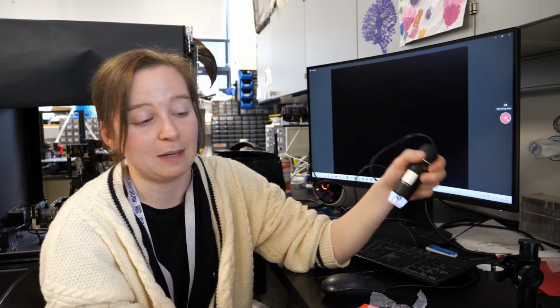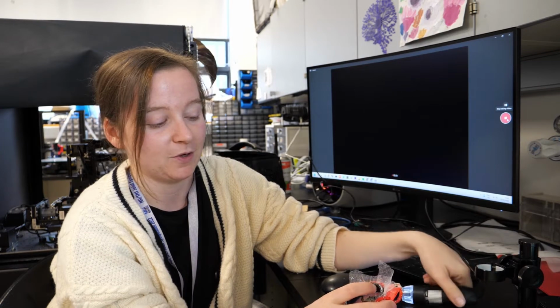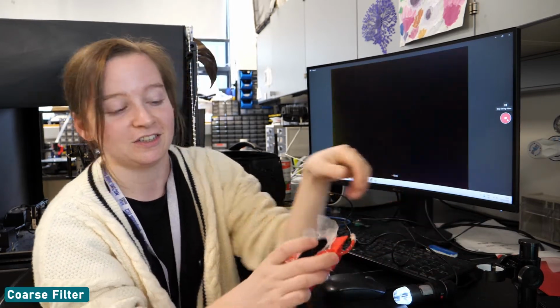So now we're going to start looking at our samples from location 3. And what's really interesting about this is that at the time of taking the samples, we noticed that we could see a lot of rubbish in the sea. We could see a lot of oil in the sea, and it was the dirtiest we had seen it in quite a while. So it'll be interesting to have a look at our filters. And straight away, before even using the microscope, I could see that there's a lot of plastic and other material on this filter. So I'll just show you.